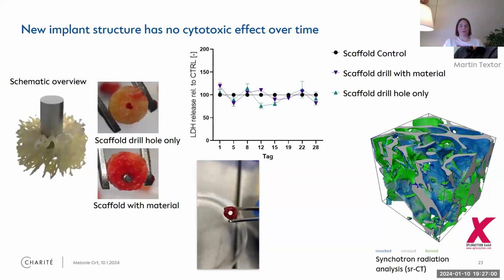And we were also able to do CT on that. Here you can see bone formation and bone resorption. Again, if you have a lot of bone loss, that's bad. But here, Martin could actually observe that this nail was not influencing bone homeostasis in a bad way.